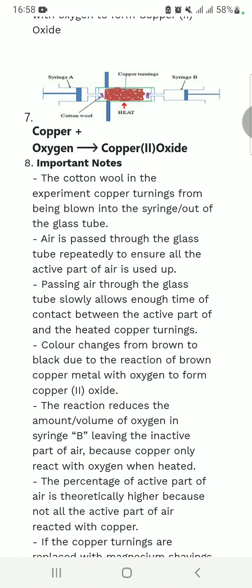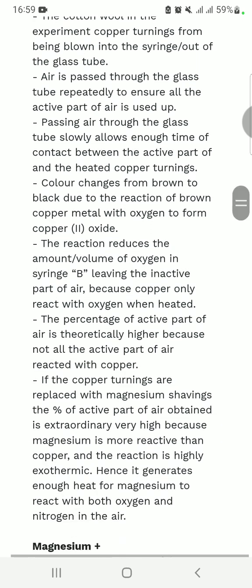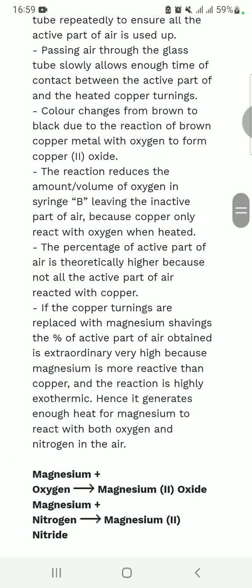The color changes from brown to black due to the reaction of brown copper metal with oxygen to form copper oxide. Copper oxide is black. The copper metal itself is always brown, so when oxygen passes through copper, you will always get copper oxide, which is black.